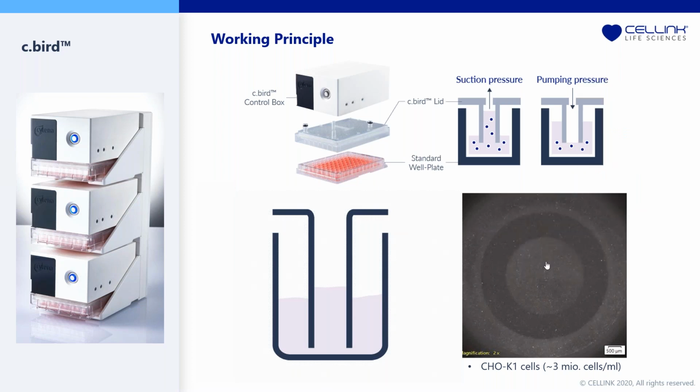So as shown in the video on the bottom right of the slide, we have placed a camera at the bottom of the well while the system is operating. And you can see that the cells are being pumped up and down in all the wells, and all the cells can be resuspended and kept in suspension inside all the wells.